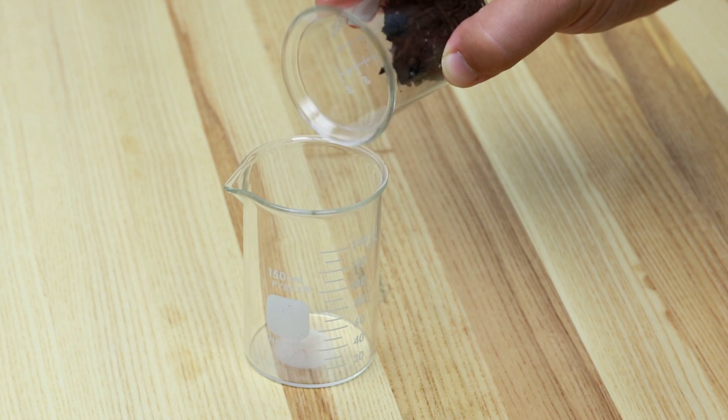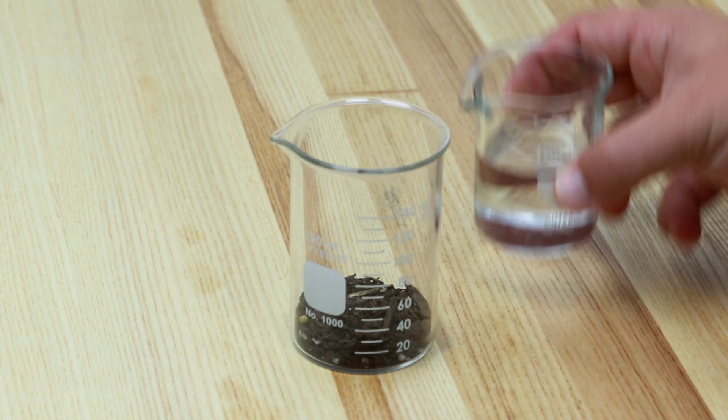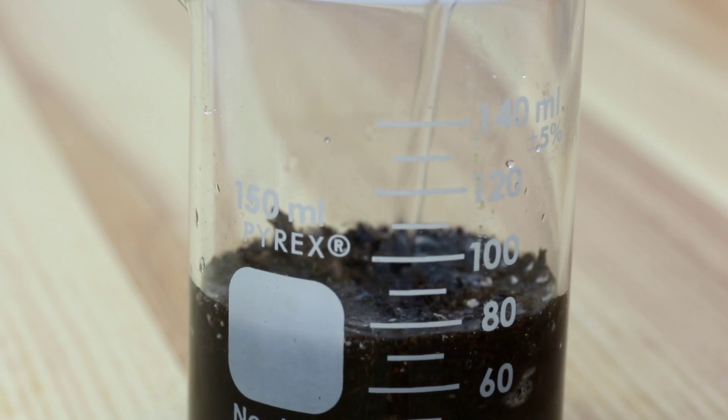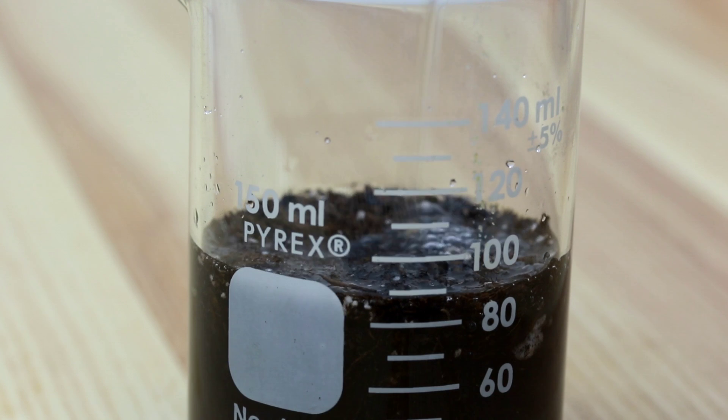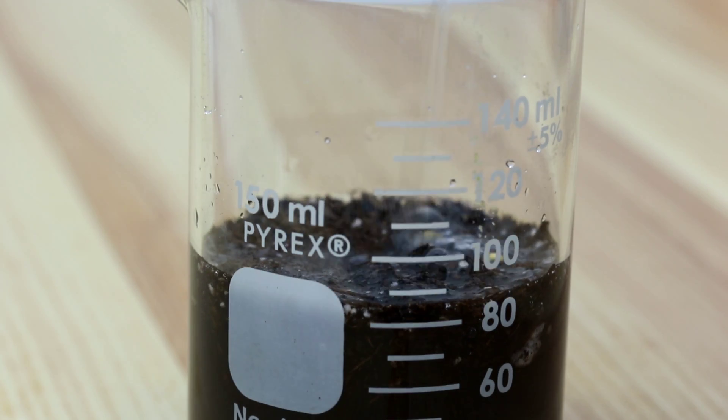First, put your soil into the container. Next, add your distilled water. The correct proportions of a soil slurry are one part soil and two parts water. Be sure to use enough sample to fully immerse your electrode.